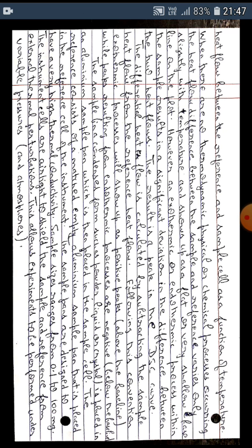The differential heat flow is calculated by subtracting the sample heat flow from the reference heat flow. Following this convention, exothermic processes will show up as positive peaks, that is above the baseline, while peaks resulting from endothermic processes are negative and will show below the baseline.